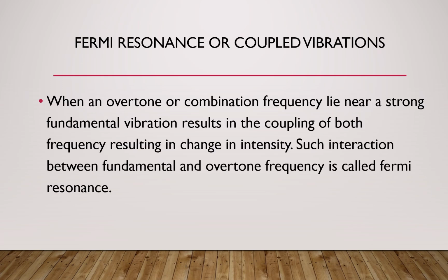Fermi resonance or coupled vibrations. Sometimes you have an overtone or combination frequency lying near a strong fundamental vibration. In that case, what will happen? Both of them, the overtone and the strong fundamental vibration, will couple, and that results in a change in the intensity. Such interactions are called Fermi resonance or coupled vibrations.